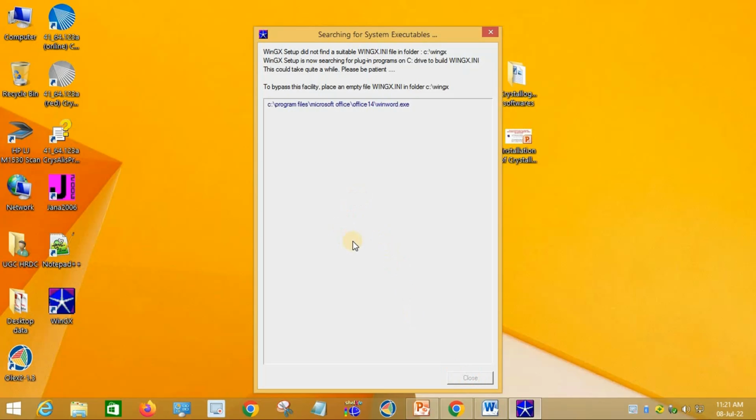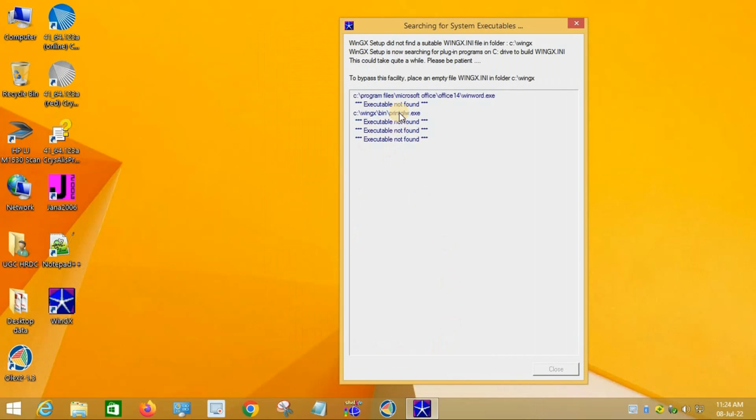Meanwhile, I am going to pause the video and as soon as it completes, I will restart the video. So now you can see the program is running and it will take some time. Sometimes it may take 4 or 5 minutes or even 10 minutes. So don't panic during this period.